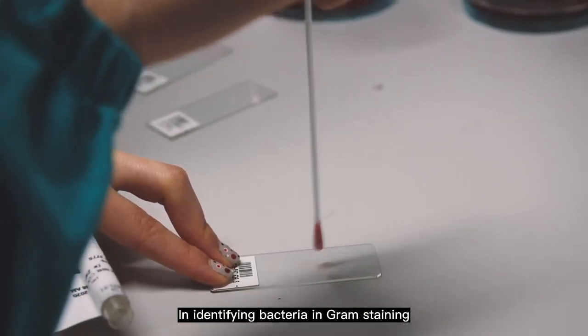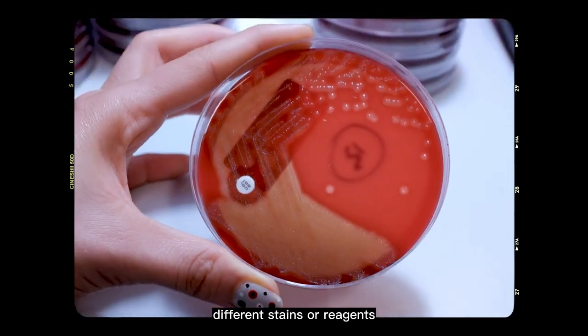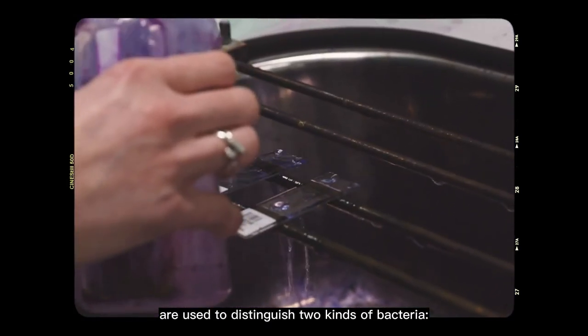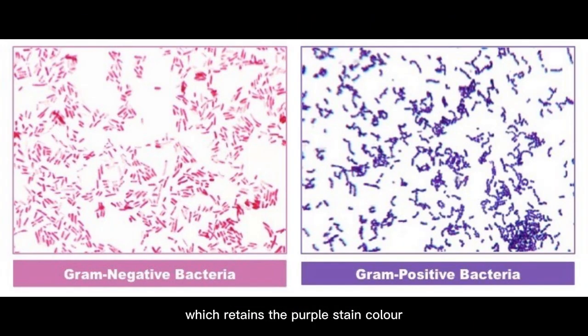In identifying bacteria in Gram staining, different stains or reagents are used to distinguish two kinds of bacteria: Gram-positive bacteria, which retain the purple stain color, and Gram-negative bacteria, which exhibit pink or red color.